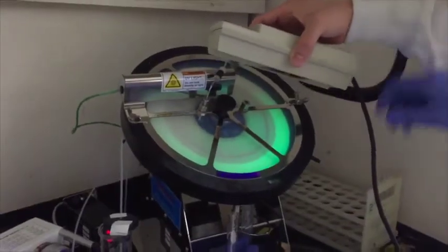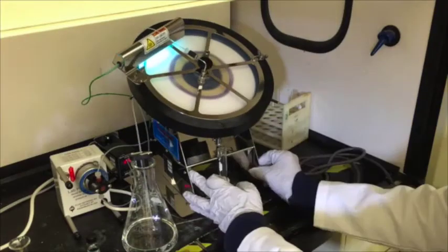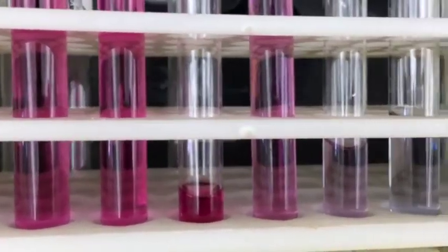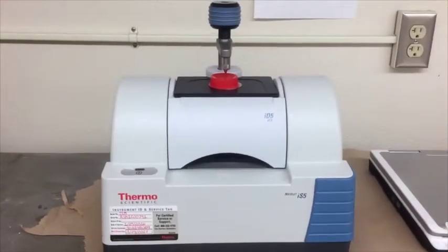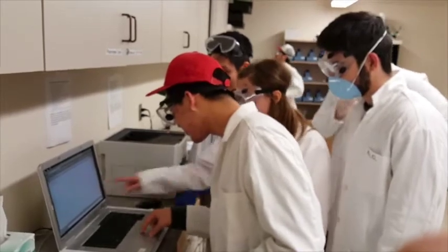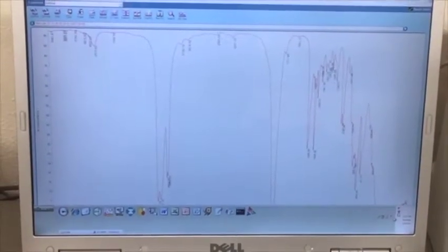Of course, we would get nowhere in research without our amazing lab equipment. This cyclograph has the ability to quickly and efficiently separate and purify a compound. And as you can see, the result is a beautiful array of separated and purified components of a once impure compound. The infrared spectroscopy machine is one of the most important tools in our research lab. With this machine, the structure of the newly synthesized compound is at your fingertips. Important functional groups appear as peaks, and we sure love those amide stretches.